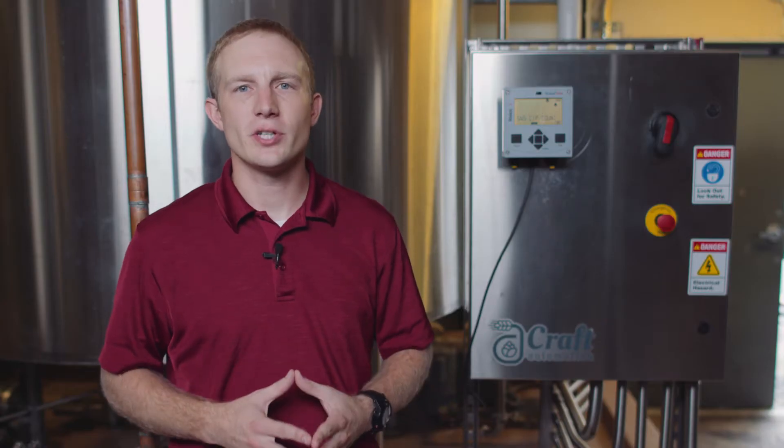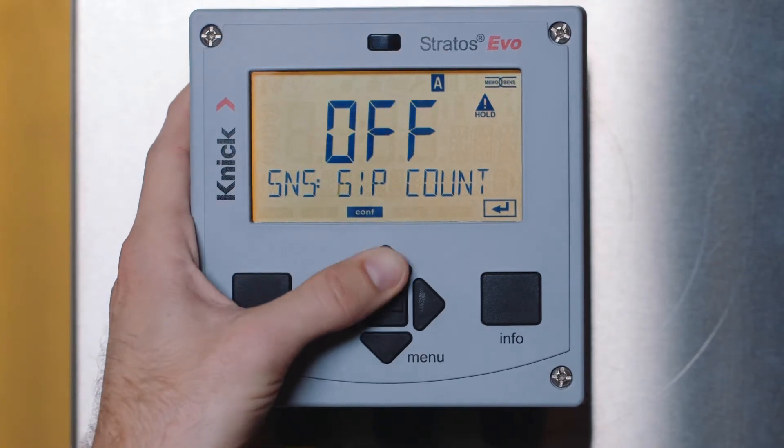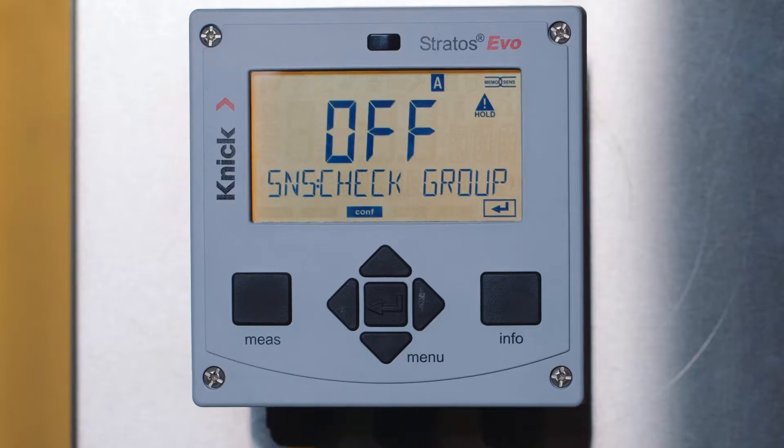Next, we have the ability to turn on both the CIP and SIP counters. With these features turned on, the transmitter will log the number of cleaning and sterilization cycles that the sensor has been exposed to. Lastly are the check tag and check group features. These features are beneficial to ensure that the particular sensor or group of sensors are only used at this measurement point.